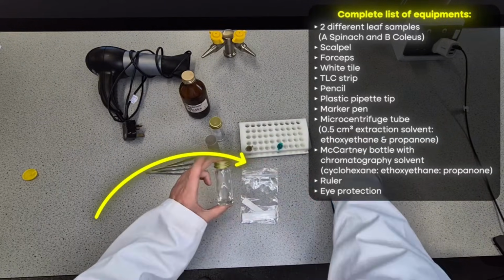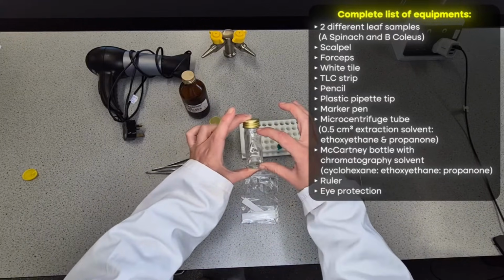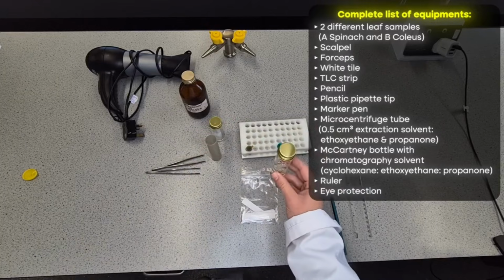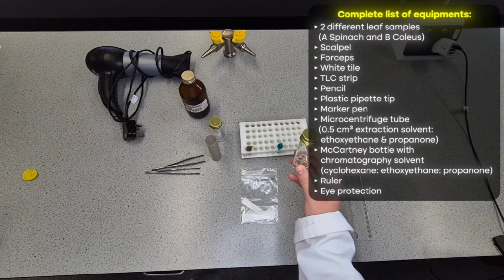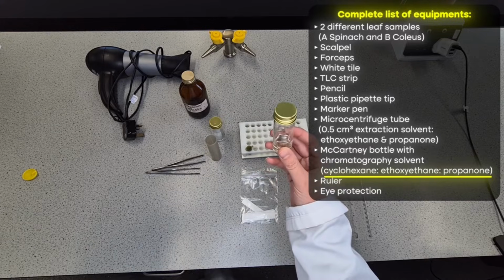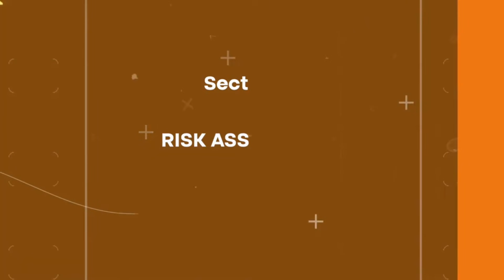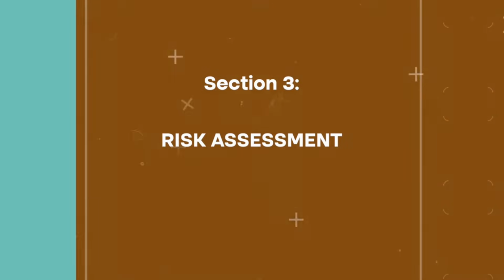Then I've got 2 McCartney bottles. Both of these hold the running solvent that I'm going to put the TLC paper inside of. And the solvent that I've got there is cyclohexane to ethoxyethane to propanone, in a ratio of 5:3:2.